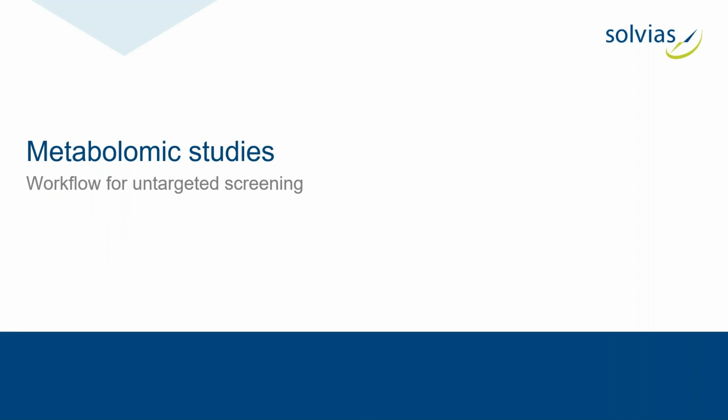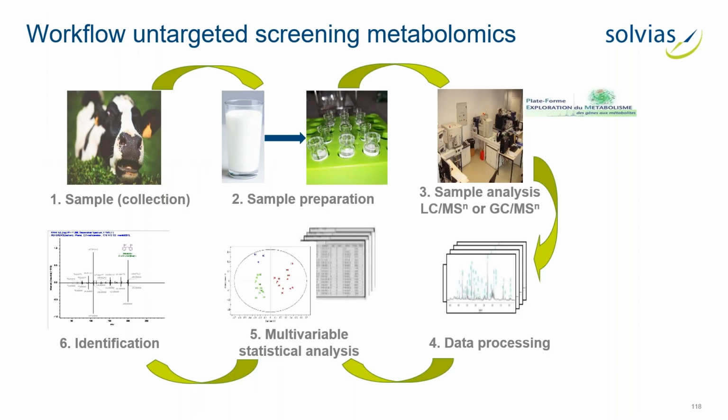Let's go forward. So metabolomic studies are quite common. They now have a dedicated workflow for how to do it. Mainly they use untargeted screening now in combination with targeted screening. It's very important to use both, which is what we're also doing in E&L.